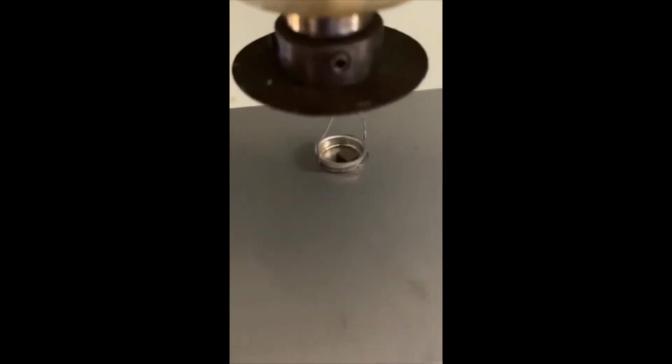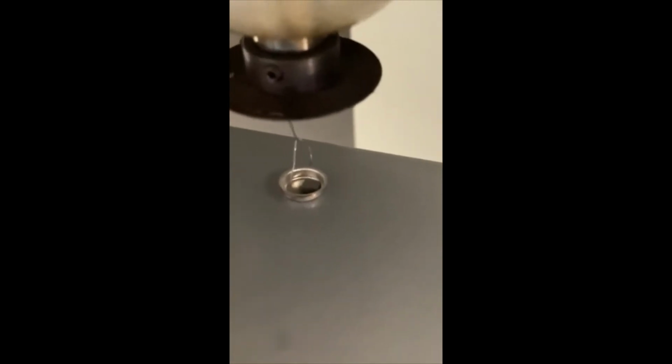Remove the test sample from the bag using tweezers to place the sample into the hanging basket sample pan. Gently lower the platform to allow the sample pan to hang, and then swing the platform out of the way of the furnace. At this point, make a note of the sample weight.